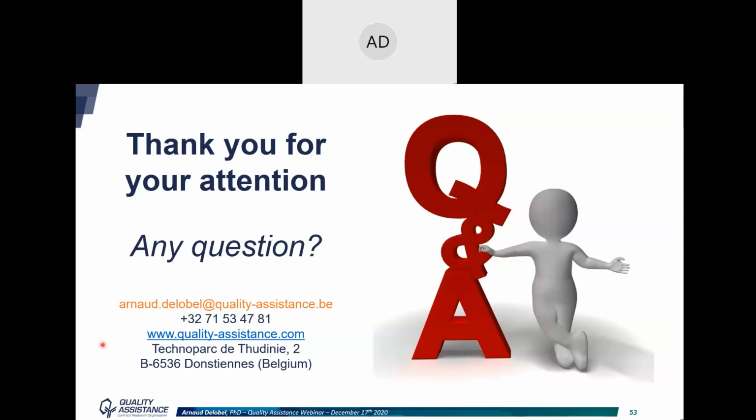With one remark anyway: by icIEF, usually you get a lower sensitivity. So for the minor isoforms, it may be slightly lower. If you have a lot of small isoforms, it may be tricky to get a very good limit of quantification.